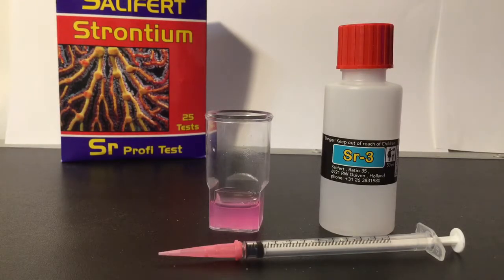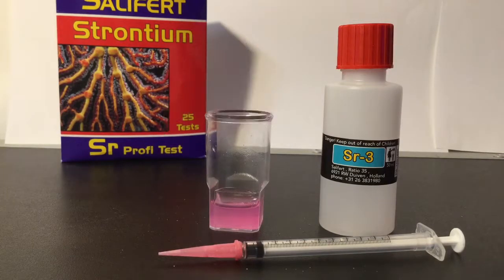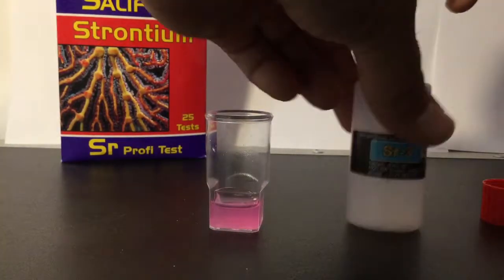If the color has changed to blue and remains so even after an additional 30 seconds, then the calcium concentration is far too low and should be corrected before doing strontium testing. It might sound confusing talking about calcium, but just bear with me — it's just part of the test. It's long and complicated.